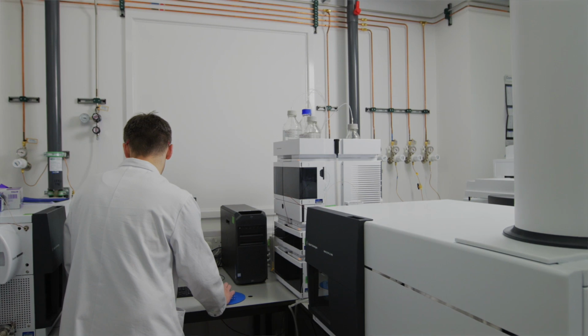Yeah, I guess if we run it and we find that it's not actually halogenated phenols that's causing the problem, we can do maybe a more general screen where we can run the sample against a control. So we'll always ask for a control sample to run alongside a tainted sample, and then try and spot any differences between the volatile profiles. That's my perfect scenario. Start with a description, find something with the same description, tick the box.